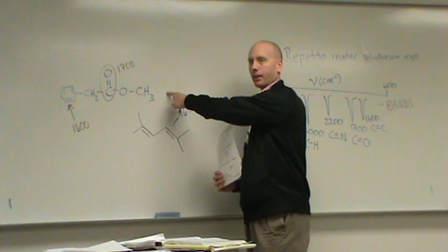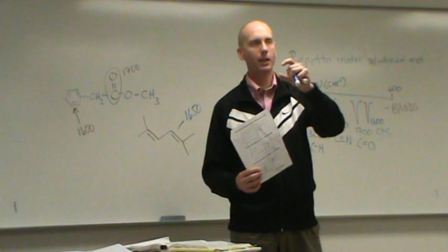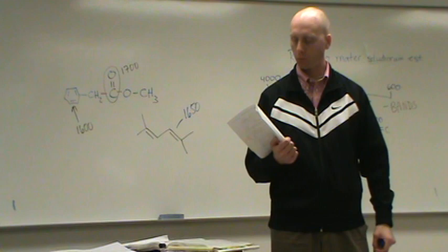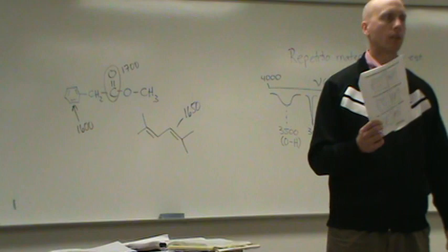Okay, why is that? Well, when you have benzenes in there, their CHs tend to be very short in the band. When you have non-benzenes, they tend to be a lot stronger carbon hydrogens in terms of the absorbance, okay? And we'll see that in some other examples. Why don't you look at the middle one? See if you can write down some data about this middle spectrum.